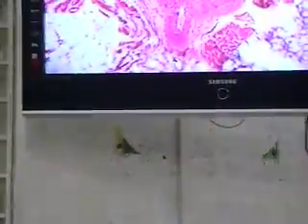Alright? And we see a lot of what? Adipose tissue. Lots of adipose tissue. See? This is full of adipose tissue. Whoa, this is beautiful. This and this, that's the same thing. Okay? So now that tells you what it is. So this is in cross section and this is in longitudinal section. This is an LS of this. So this structure is going like this. Look, Sean. He's going like this, and at this point he's cut right through at CS, and then he turns like that, and he's cut through at LS.